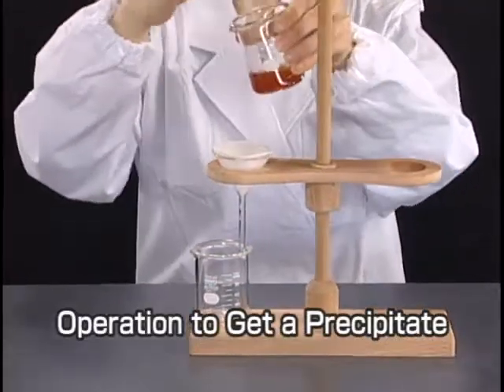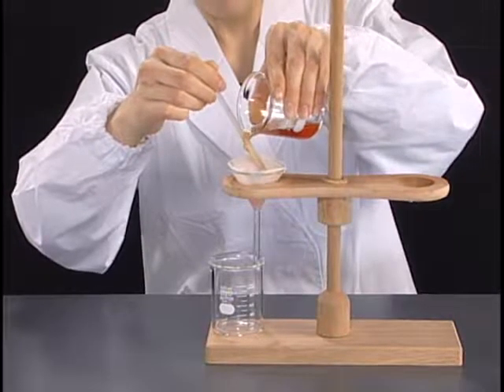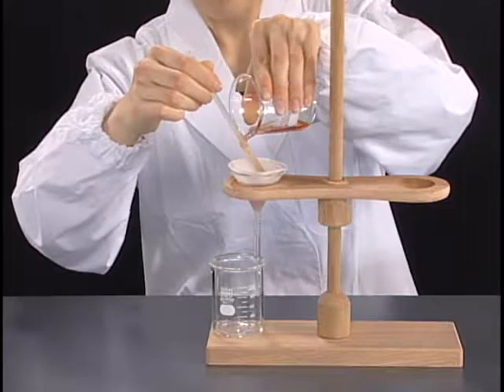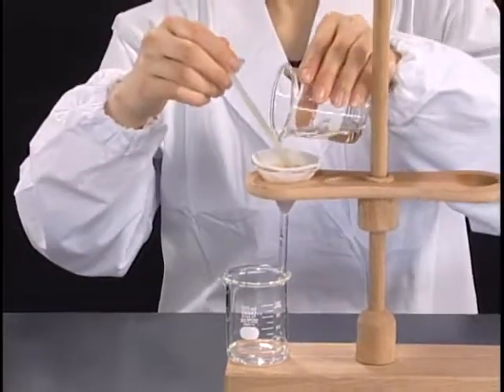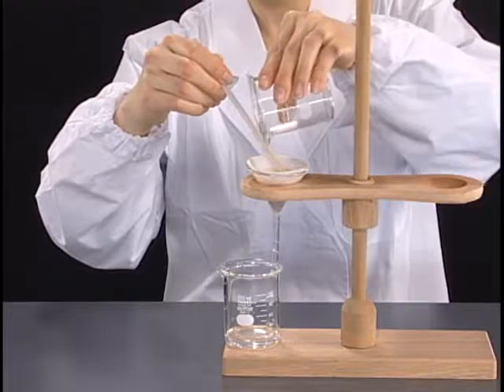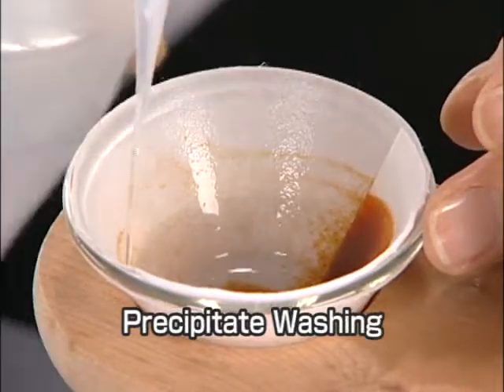When the precipitate is needed, quickly pour the swirling sample onto the filter paper. Next, add the filtrate to the remaining precipitate in the original container and then pour the mixture onto the filter paper again. Wash the collected precipitate on the filter paper with a washing liquid two or three times.